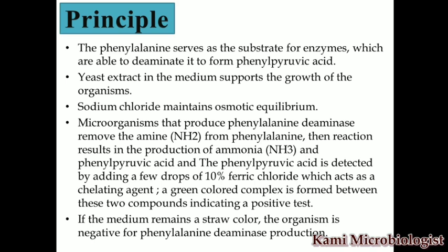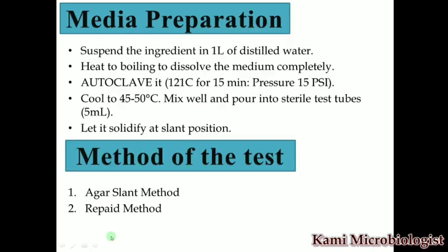After that we get the green color complex that is formed between these two compounds, indicating a positive result. Now the last point of this principle says that if you get the medium straw in color, the organism is negative for phenylalanine deaminase production. You have media preparation. So how will you prepare the media?